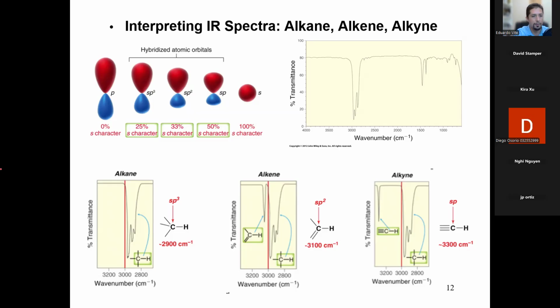And so you see here, I want to emphasize where the peaks are. Let's see what happened now. Annotate. I have to draw them, and I have to pick a color. Here we go. Okay, so here the peaks are just this whole thing right here. I call those the stalagmites. That's always present in all molecules because organic chemistry is the chemistry of carbon. Carbon will bond to hydrogen.